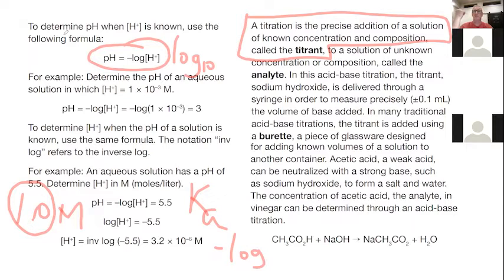because usually when a company provides a concentration of a strong acid or a base for titrations, it's usually to at least 2 significant digits and sometimes 3. Let's just use 2. We'll use 1.0 for the concentration of the sodium hydroxide.